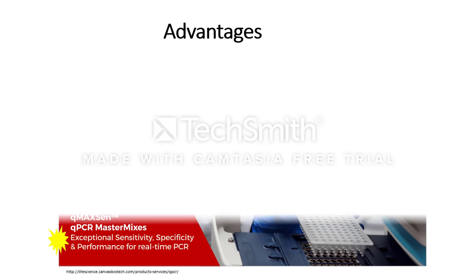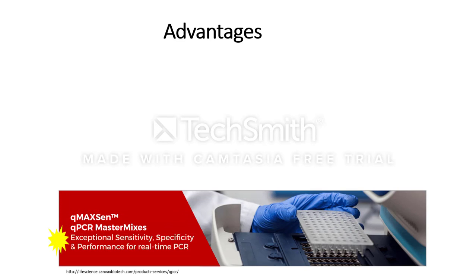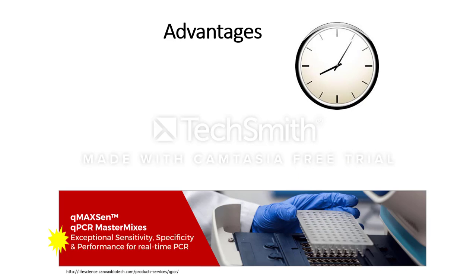What are the advantages of using qPCR? This technique has improved precision in the quantification of target sequences. It is capable of measuring initial concentration of target DNA over a vast dynamic range and with a high degree of sensitivity. As little as one copy of template DNA is initially needed. It allows for the ability to process many samples at the same time. This technique increases the overall speed of gene expression analysis.